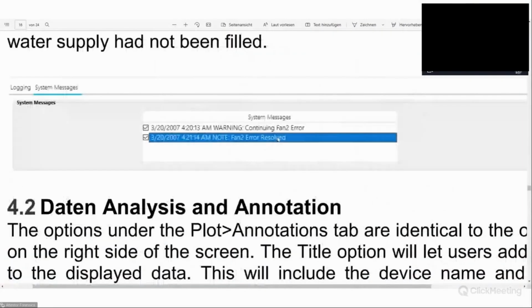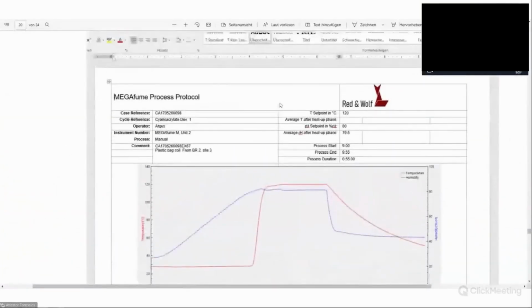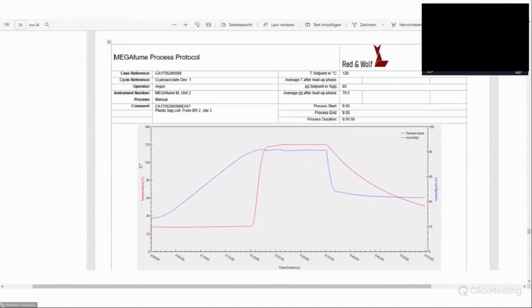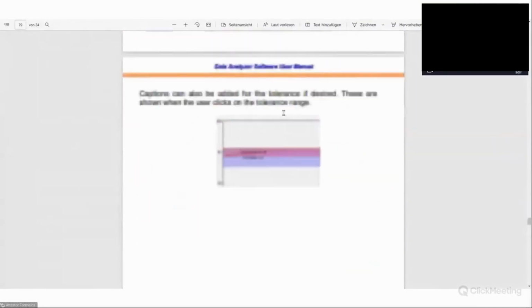There must be a section where it says how you can actually transfer that out. So in that display, you're able to kind of mark and note and whatever certain things. Now for exports, you have different options. One option would be to actually just export that picture as a picture. You can export the complete thing as a JPEG, but you can also export that directly into Word. So there are different options of how you export the stuff.